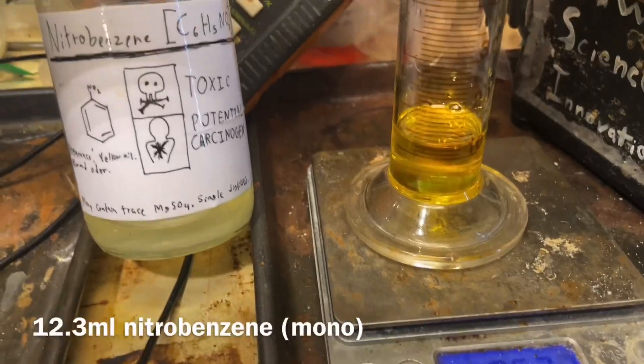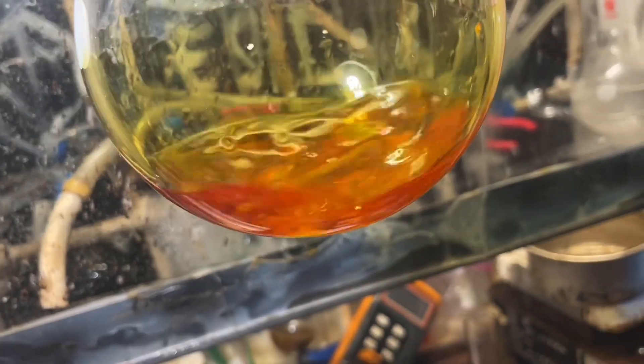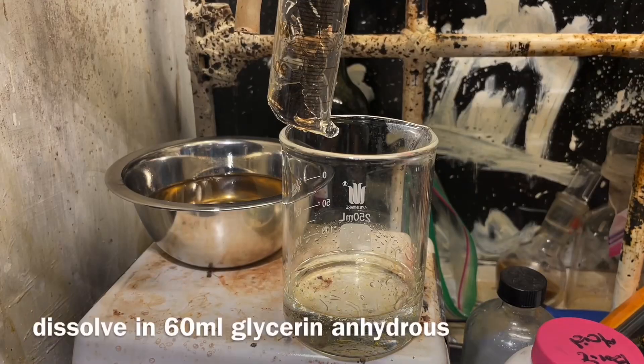2 sulfate hydrate, 18.5 milliliters of aniline, 12.3 milliliters of nitrobenzene, and we're going to combine it all into a 500 milliliter flask and weigh out 12.5 grams of boric acid and add that into 16 milliliters of glycerin to dissolve.